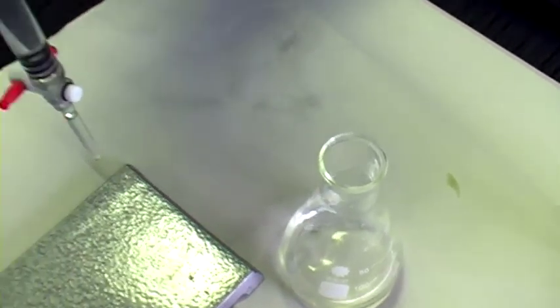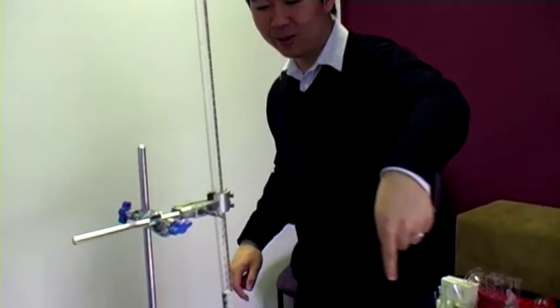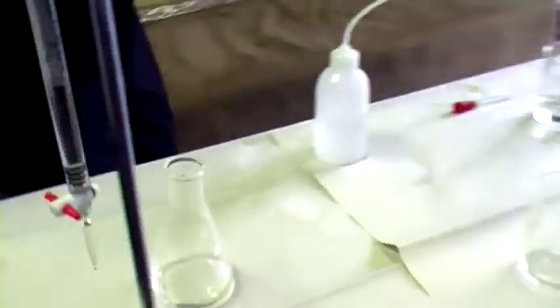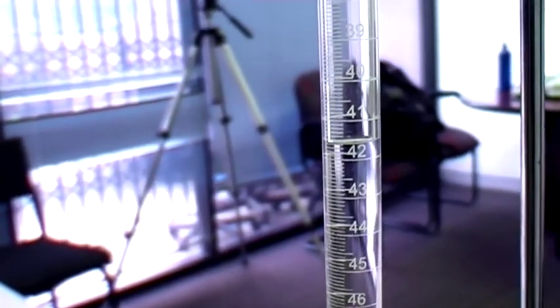Our final reading is 41.7 — we started at 18.6, giving us 23.1 mLs. Exactly the same as our first titer and also our rough titer. A rough titer shouldn't be this accurate, but I got lucky and got it down to the single drop. So far we've got 23.1, 23.1, 23.1. Record our results.